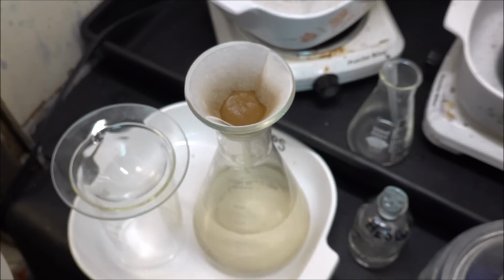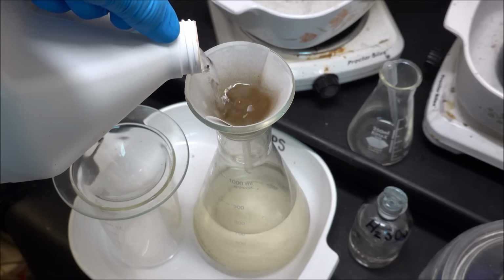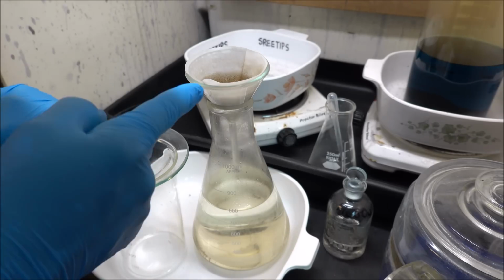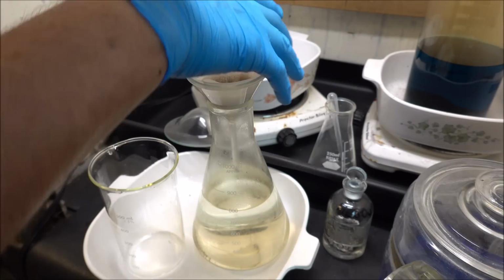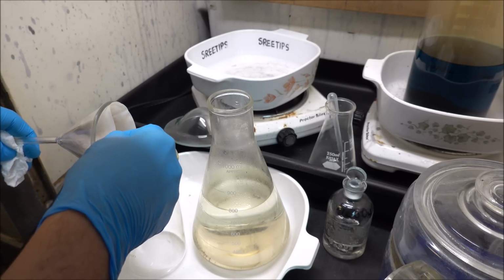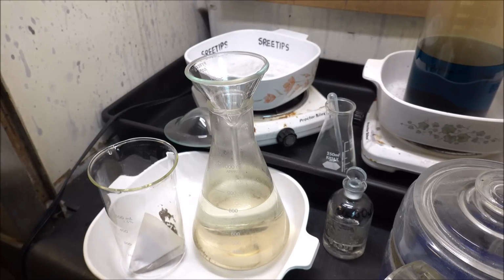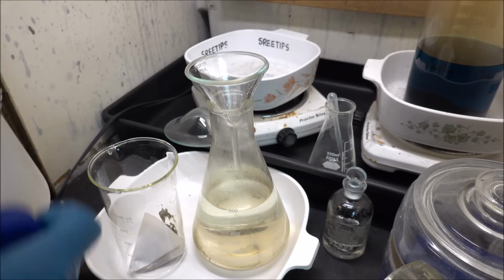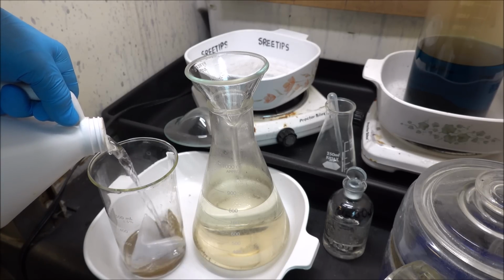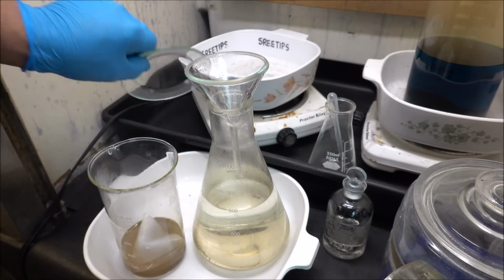Now I'll rinse the gold with some hydrochloric acid right in the filter. Now I'm going to put the gold, still in the filter, right into the beaker that it came out of. I'm going to cover this with about 100 milliliters of hydrochloric acid. We're going to put this up on the heat and redissolve it.